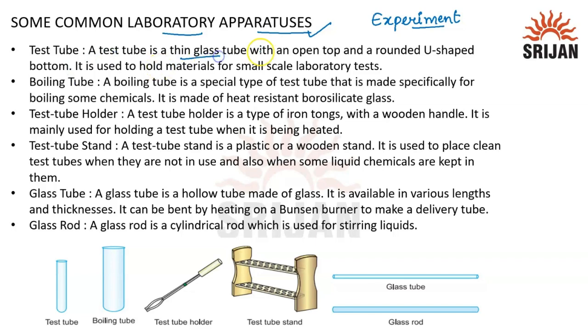A test tube is a thin glass tube which has an open top and a U-shaped rounded bottom, and it is used to hold materials for small scale laboratory tests. Means when the tests are carried out at small scale, these test tubes are used.